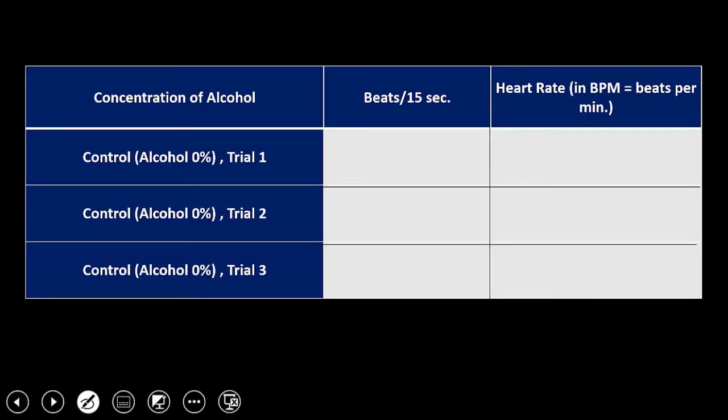For example, if the number of beats counted in 15 seconds is 20, you need to multiply this number by 4 to have beats per minute. Be aware the Daphnia's heart was beating much faster than this number. This is just an example.